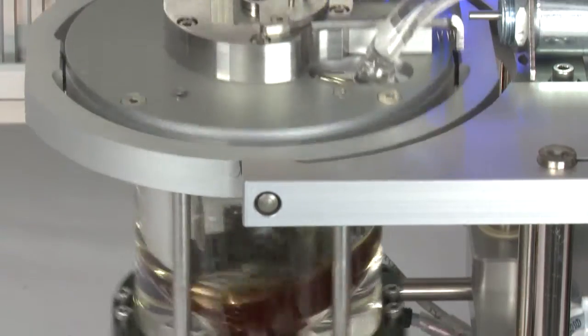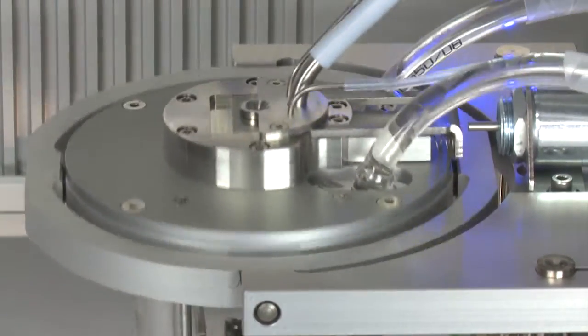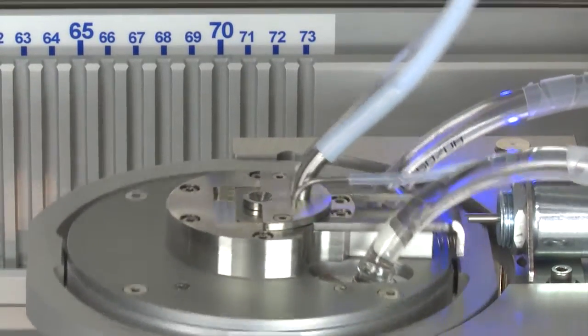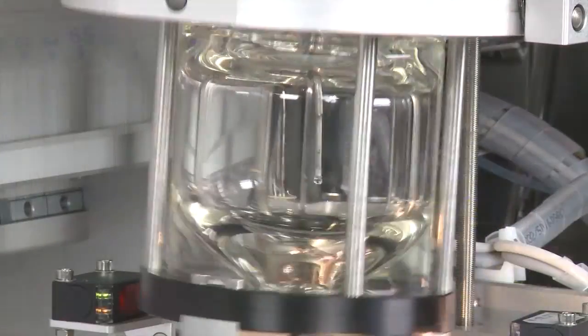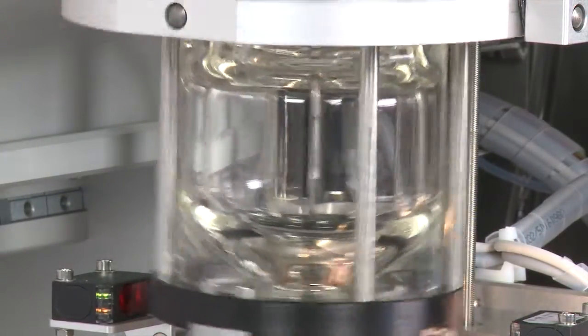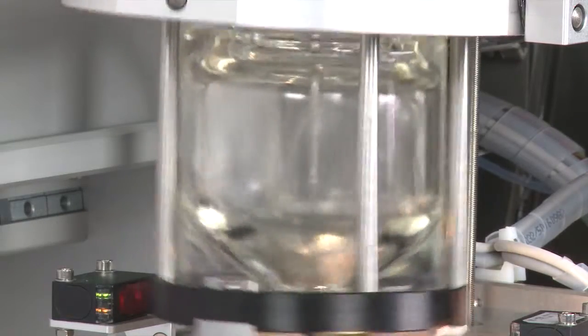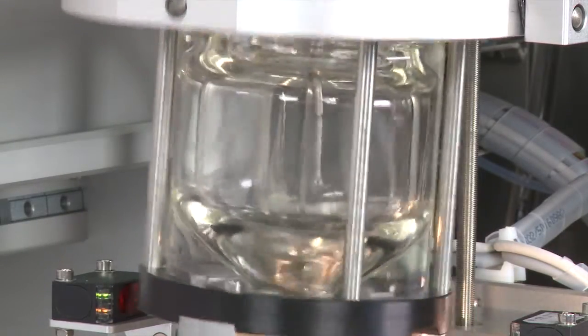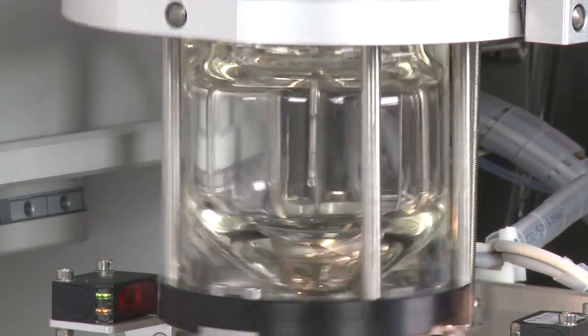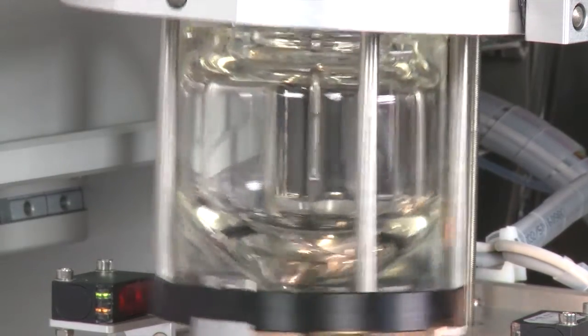The rotation in the chamber prevents effectively boiling retardation. The robot needle takes up and transfers the concentrated sample without any losses. Rotation also supports the cleaning of the chamber. This prevents cross-contamination between samples.